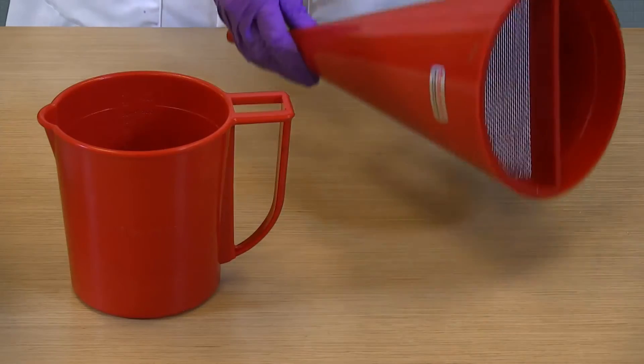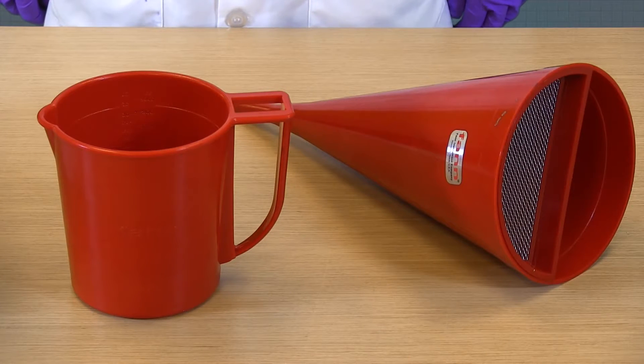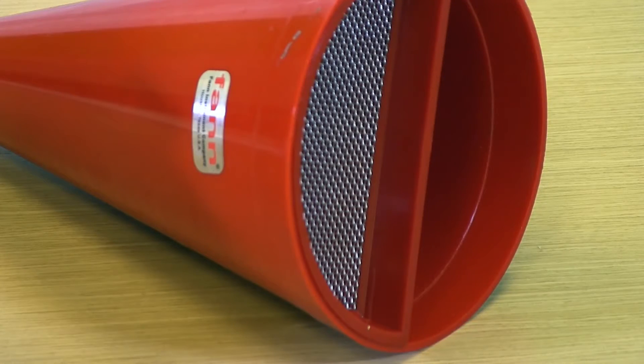When it comes to measuring the viscosity of a drilling fluid, the Marsh Funnel Viscosity Test is the one most people think of first, and probably the simplest to do. For this test, we use a Marsh Funnel, which is a 1500 milliliter funnel that has a screen near the top to filter the mud so no large or unyielded pieces are in the sample that we want to test.